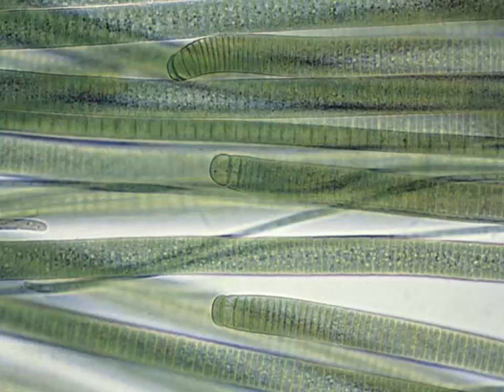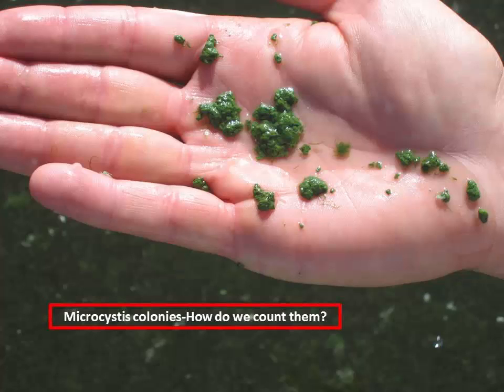In the background, though, you'll see here's another filamentous cyanobacteria, much smaller. That's probably an Oscillatoria, and so you'd have to count it as well. But how do we count this? These are globs of Microcystis, and often this is what you end up seeing. And these individual globs will be comprised of lots of colonies. So how many of those do you count?